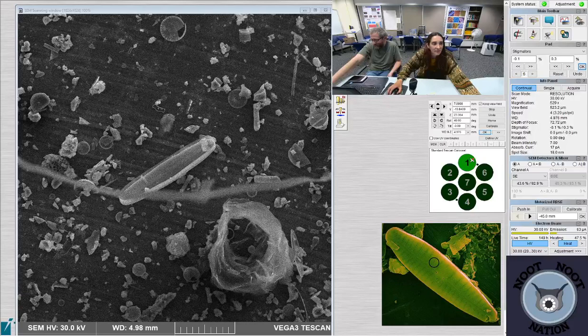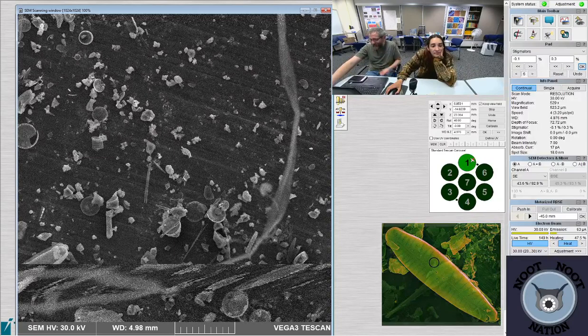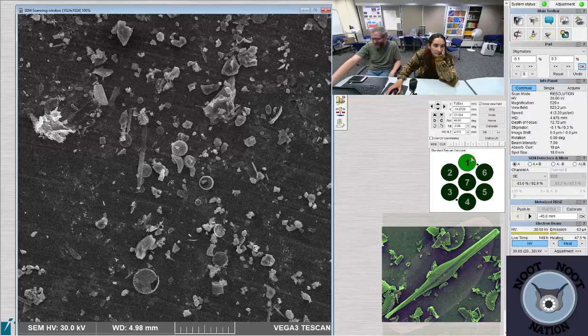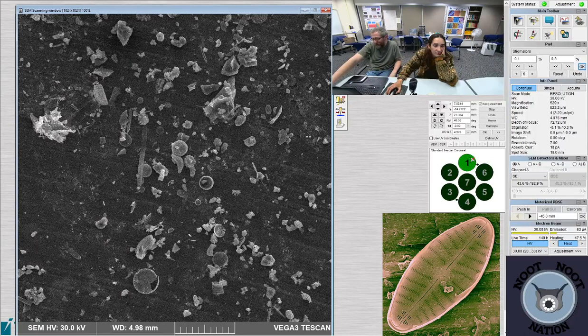How much electricity does the SEM take? I don't know. It's running a pump and two computers, and then it's making an electron charge. I don't have an electric meter on it. I have no idea. Probably a fair amount, but it's integrated into my overhead costs for the university.